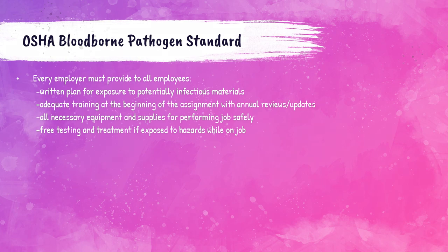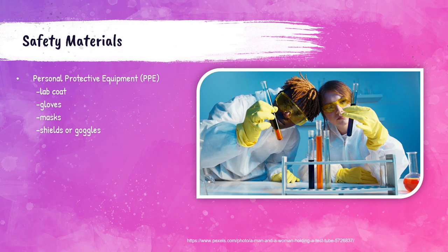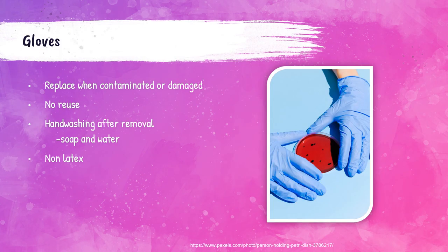Personal protective equipment, or PPE, in the lab includes a lab coat, gloves, mask, shields, and goggles. Proper glove use includes replacing gloves when they become contaminated or damaged. Gloves cannot be reused — once they get dirty, you must take them off and replace them. Every single time you remove a pair of gloves, you must wash your hands with soap and water.